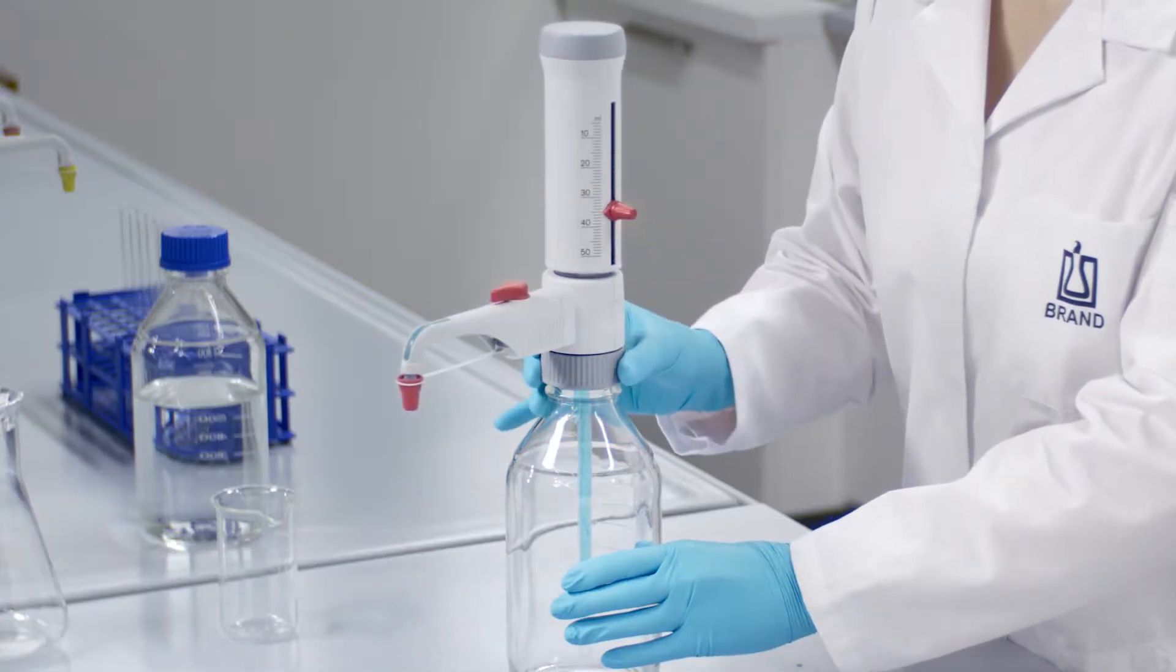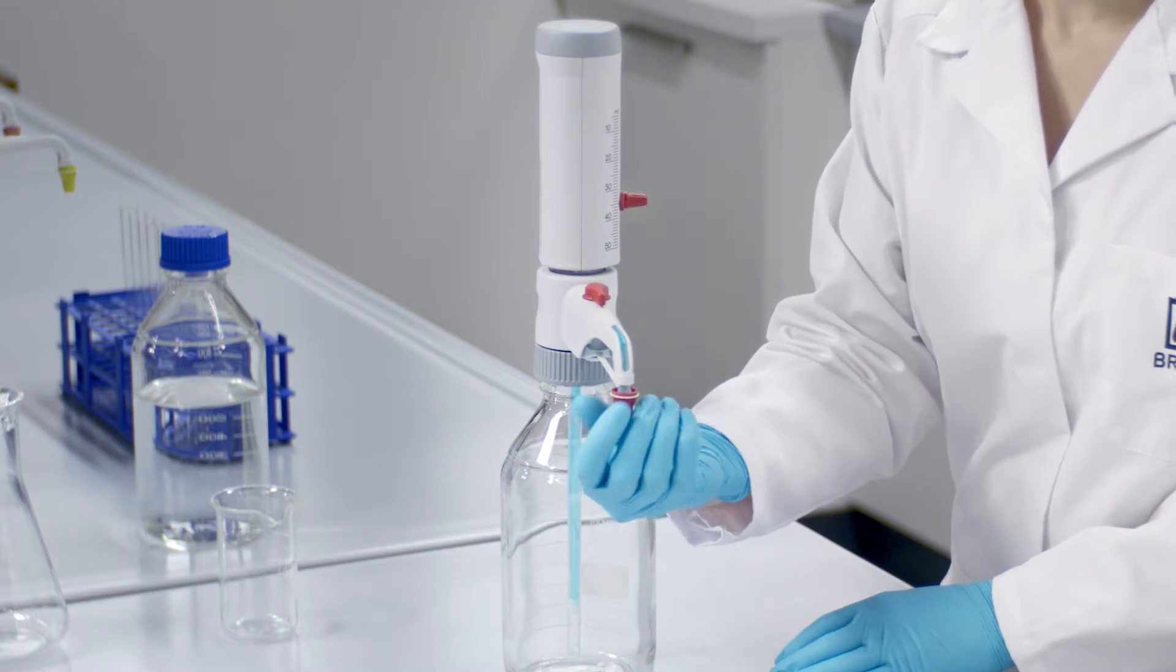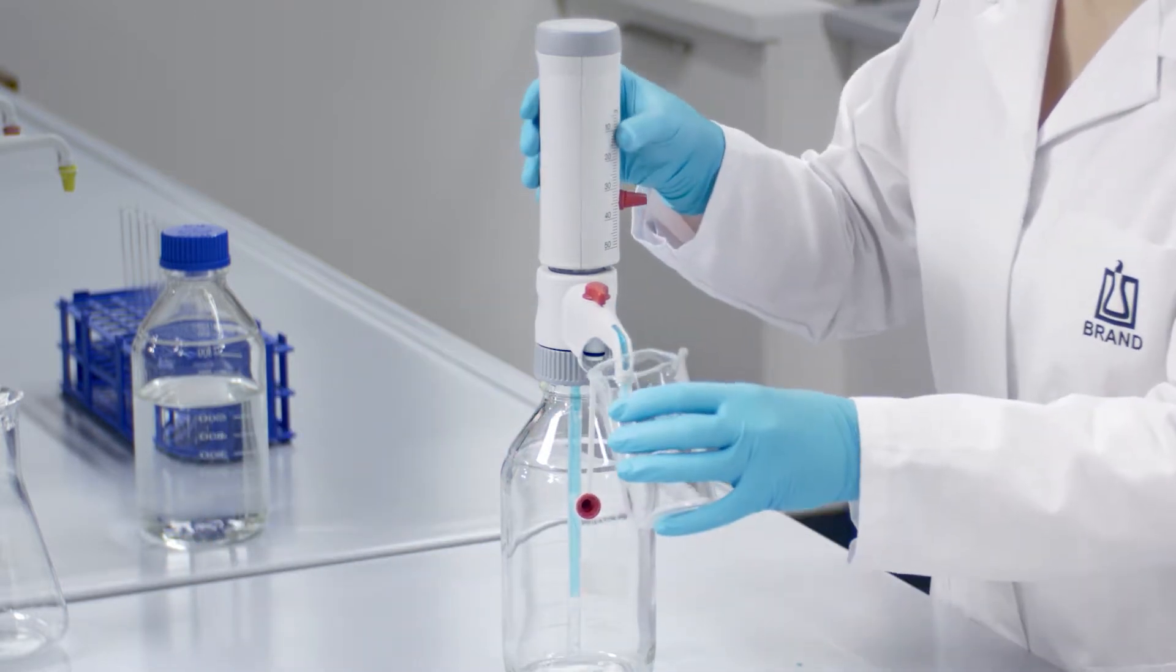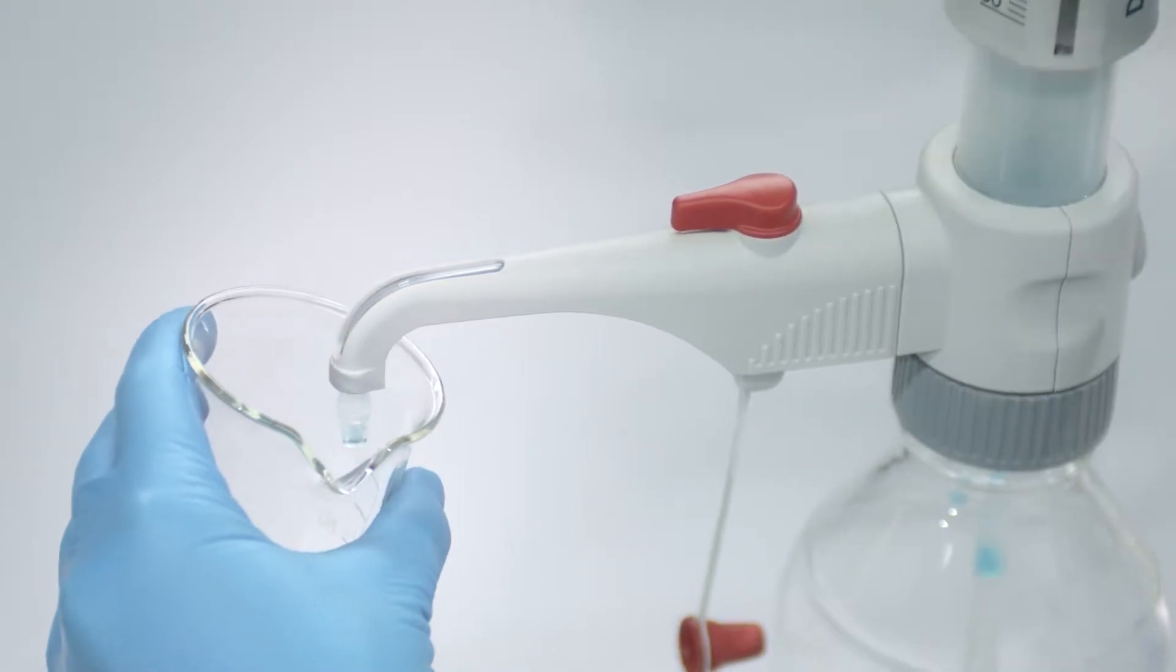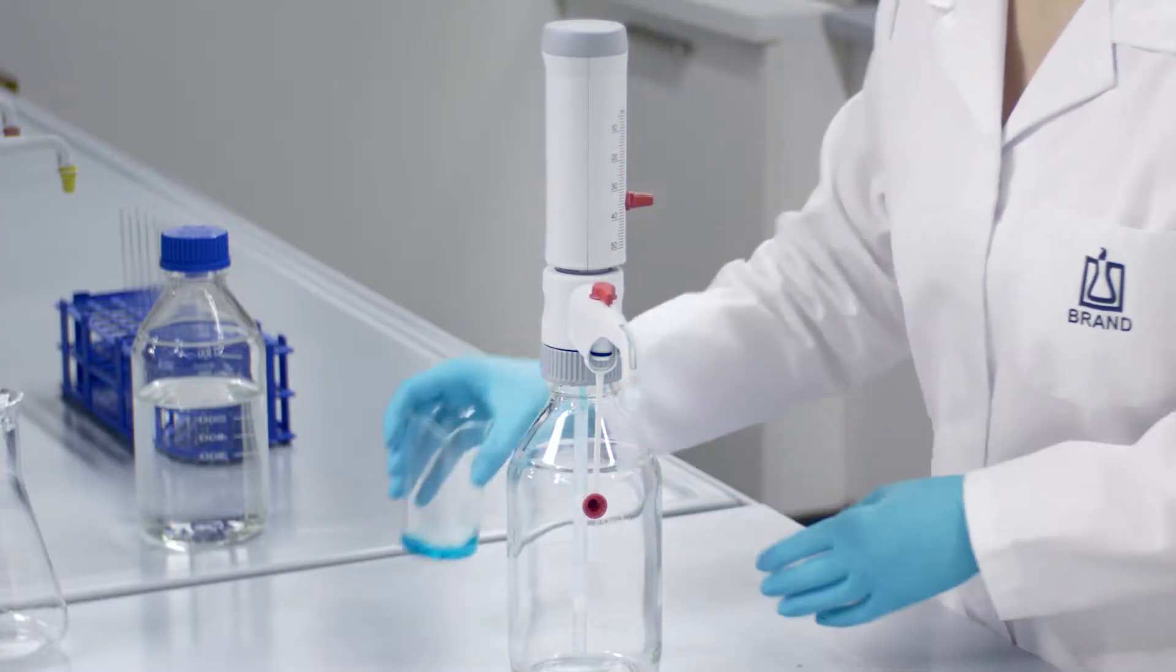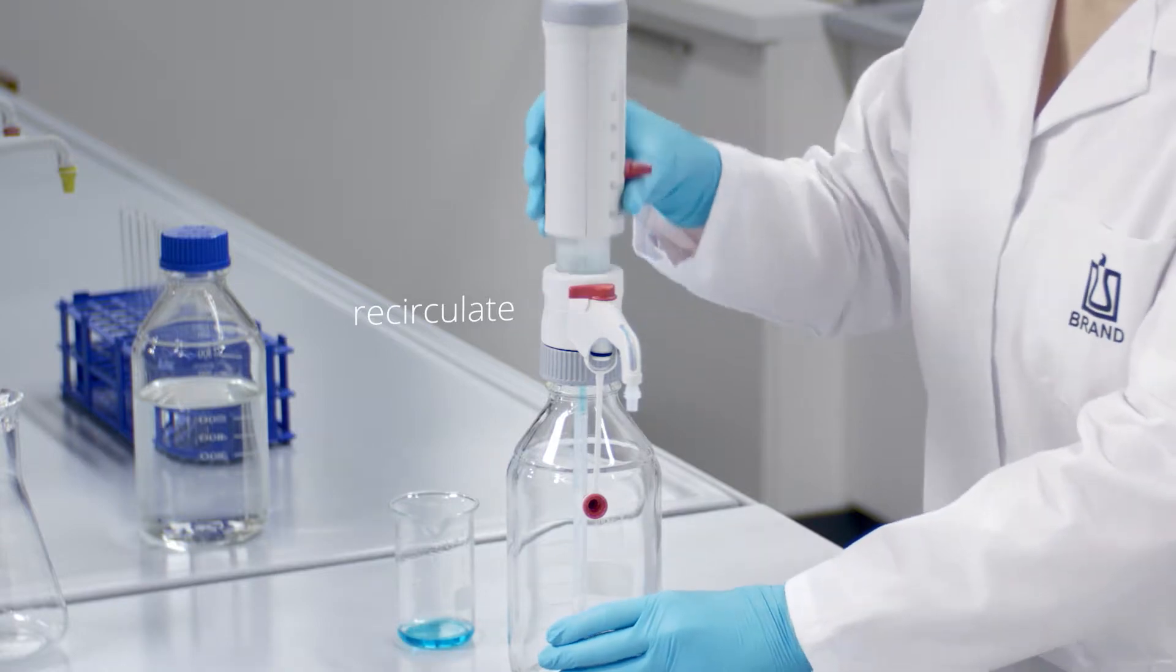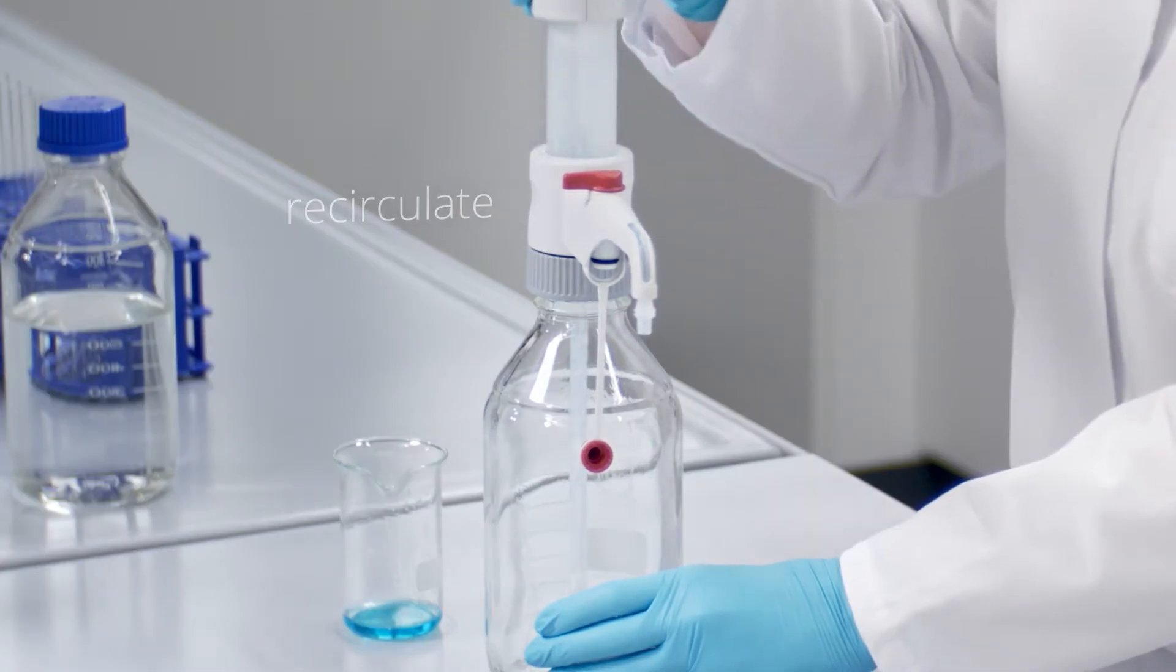Mount the instrument onto an empty bottle and empty it completely by repeated dispensing. If the instrument is equipped with a recirculation valve, it must be emptied in both the Dispense and Recirculate settings.